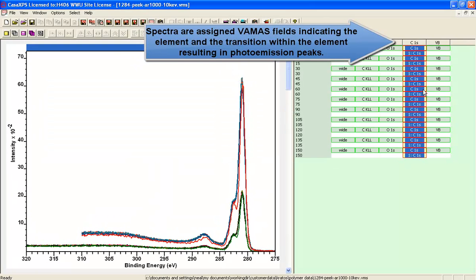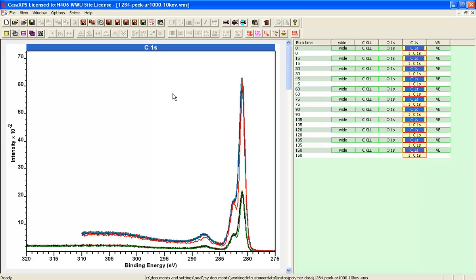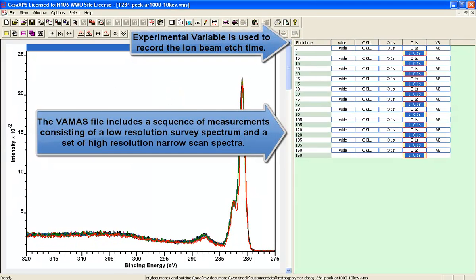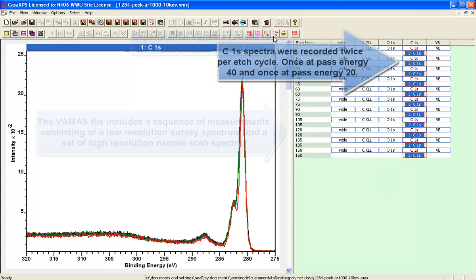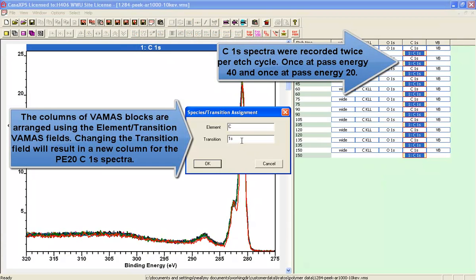We've loaded a dataset that contains measurements from a PEEK sample where the sample has been etched using an argon cluster source to monitor how the PEEK evolves as a function of etch time.